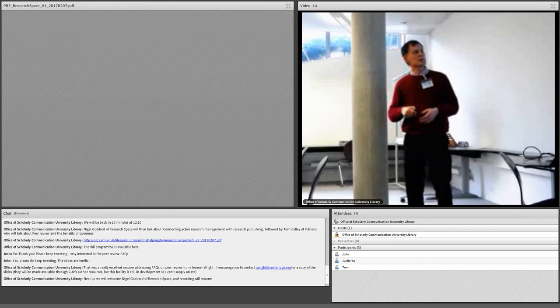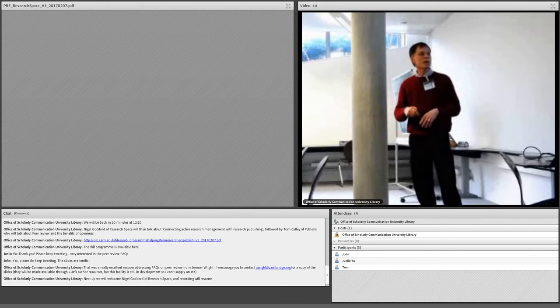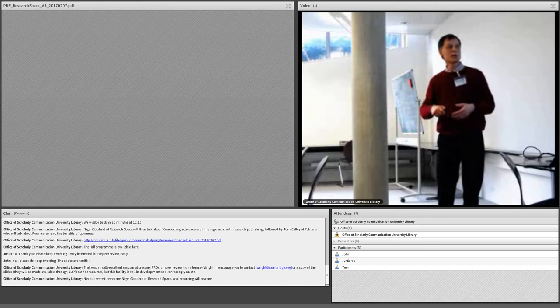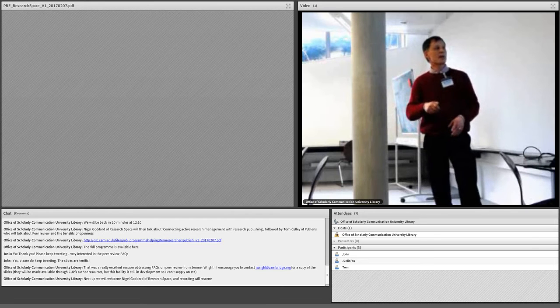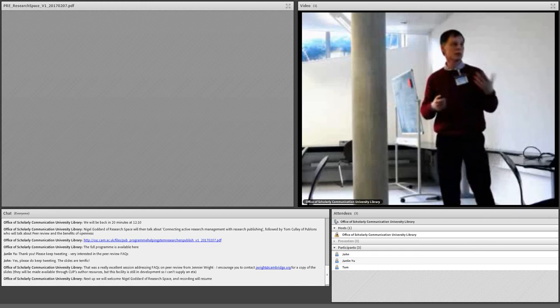And then the second component to this is, even if you do have these links to files, which are absolutely essential these days because nobody's typing all the information in an experiment into their lab notebook, the next question is, can you then easily take not only what is in your notebook, but also these files, which are an essential component? Can you easily get those into repositories, whatever kind of repositories those are? So those are the challenges, and we think that ELNs, if they're set up to support these kinds of links and this kind of deposit, which RSpace is, become much more useful as part of documenting your data and publishing it.